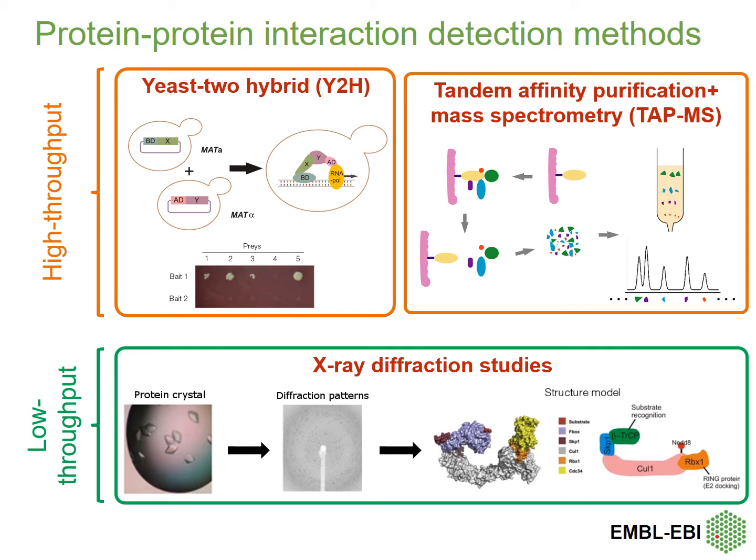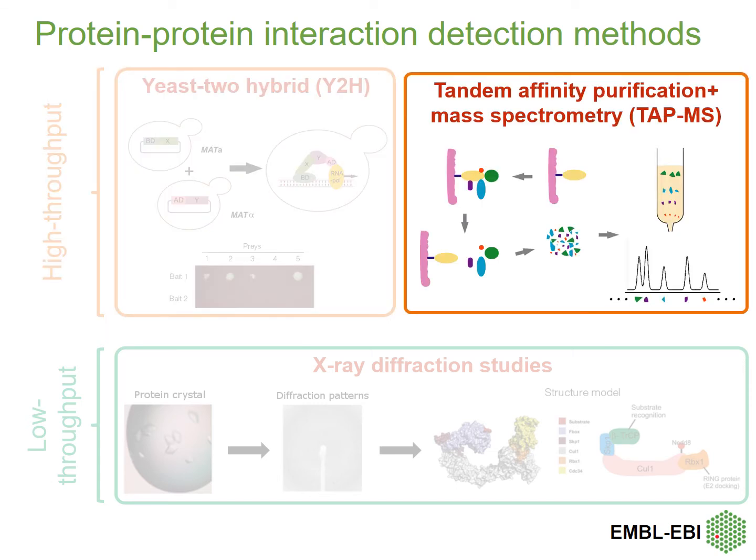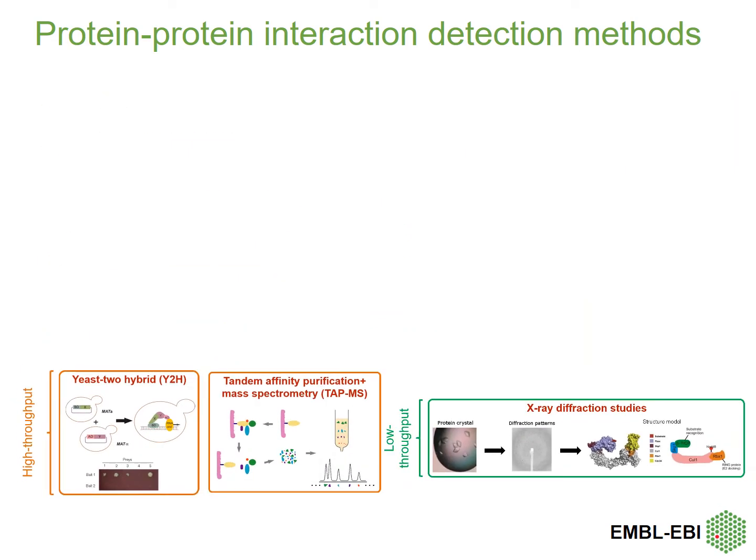So you can do a mutant version of a protein and compare it to wild type, right? So you can do disease versus non-disease and compare its structure as well. So you can compare what proteins bind, wild type and disease, and it gives you insight. And this slide is just going through, and the reason I'm not defining the two-hybrid yet is because we're going into that. And the TAP, tandem affinity purification, you've seen mass spec, you've seen affinity, and this is a combination of the two, and then the protein crystallization, we'll talk about that.